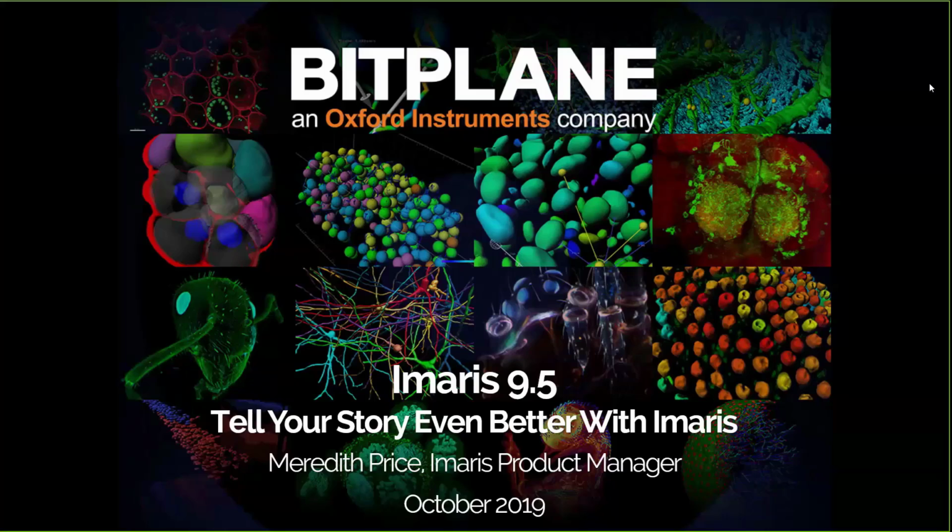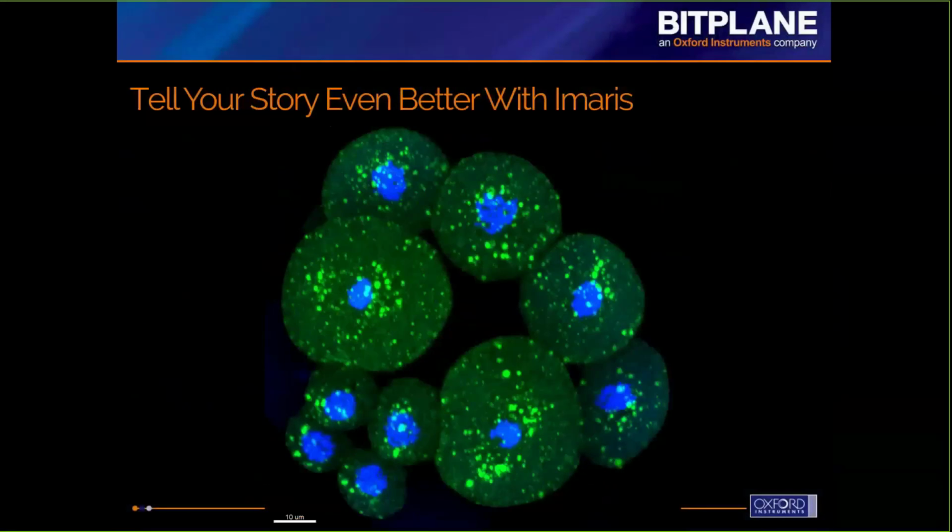And so the way that we are thinking about this is that we want you to be able to easily generate results within Imaris. And so we've made improvements that will let you more easily generate a very specific type of application that we've seen a lot of our users perform, but also we want you to have a very nice image at the end that also helps you tell the story because it's easier to interpret.